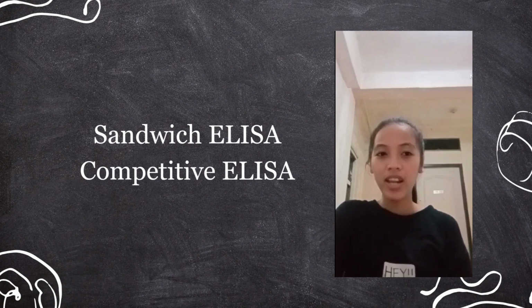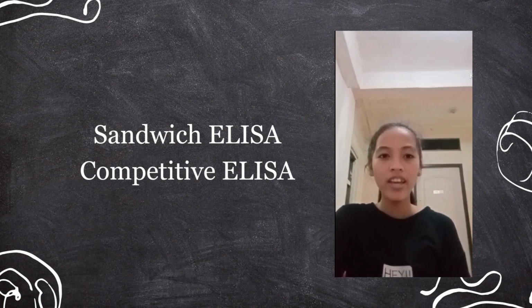So what is sandwich ELISA? Sandwich ELISA, or enzyme-linked immunosorbent assay, is a type of immunoassay used to detect and quantify the presence of specific proteins or antigens in a sample. It is based on the principles of antigen-antibody interactions.